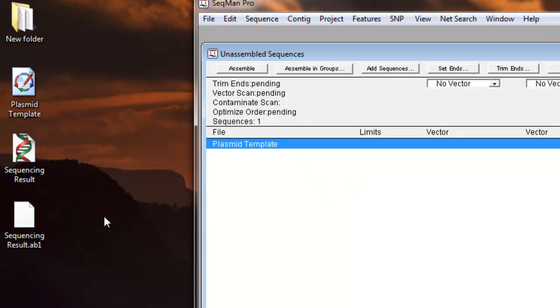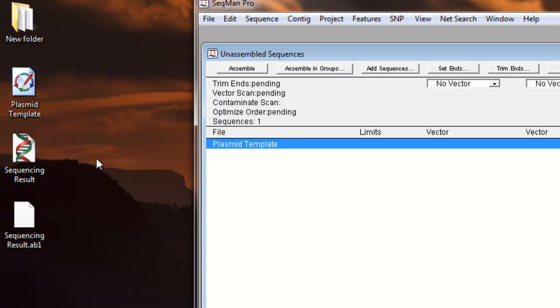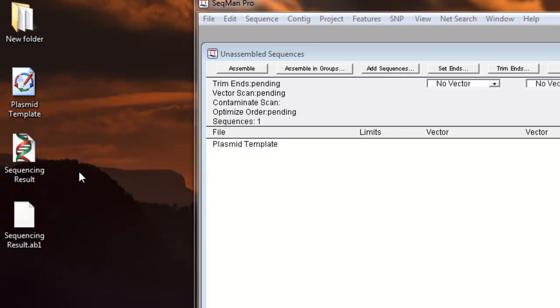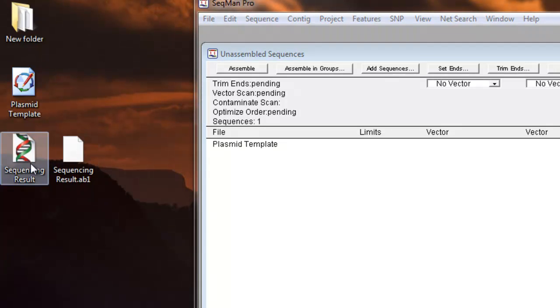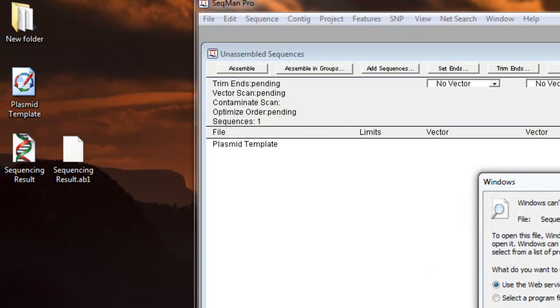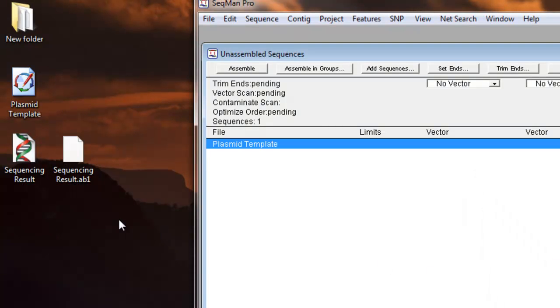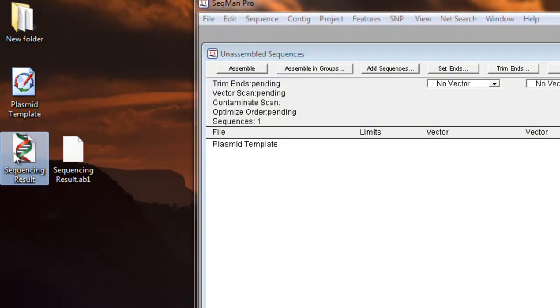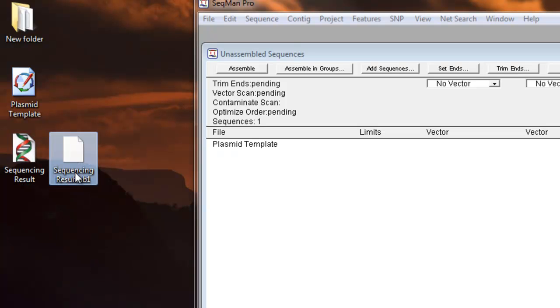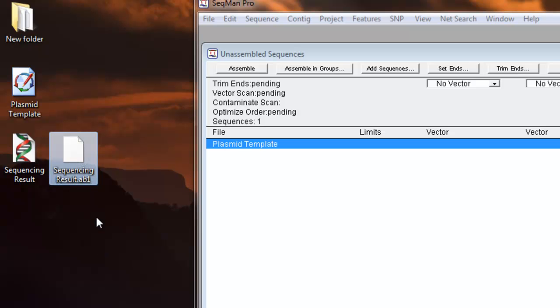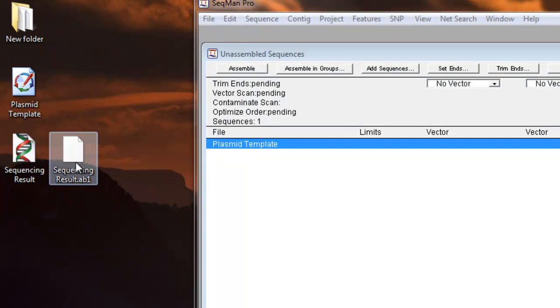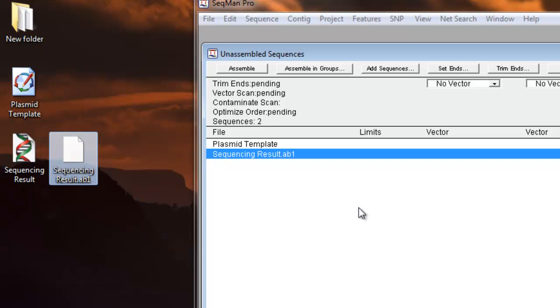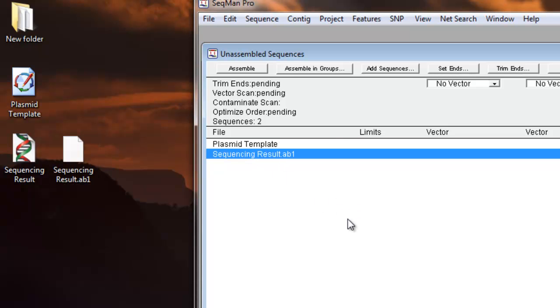Next, we're going to drag in our sequencing result that we got back from the core facility, the core sequencing facility that each university usually has. So I always get two files back. The first file is called a .seq file. And the second file is called a .ab1 file. In this case, we always want to look at the .ab1 file because this file contains the chromatogram, which I'll be showing you later. So we're going to drag in the .ab1 file. Now we have our plasmid template and our .ab1 file.